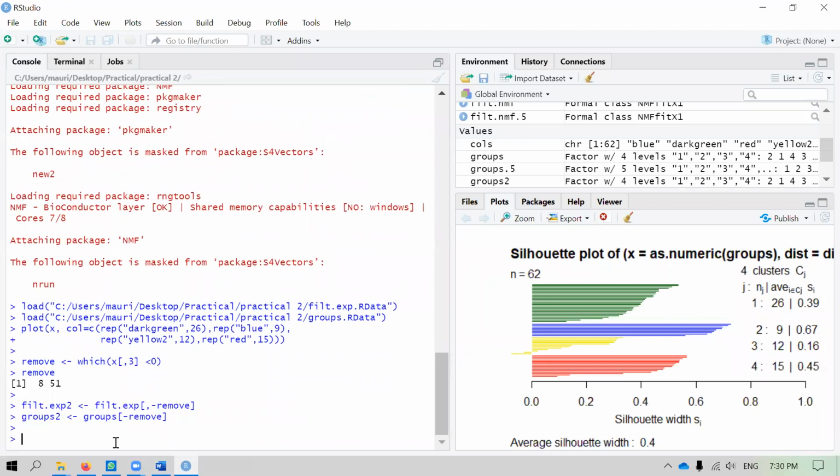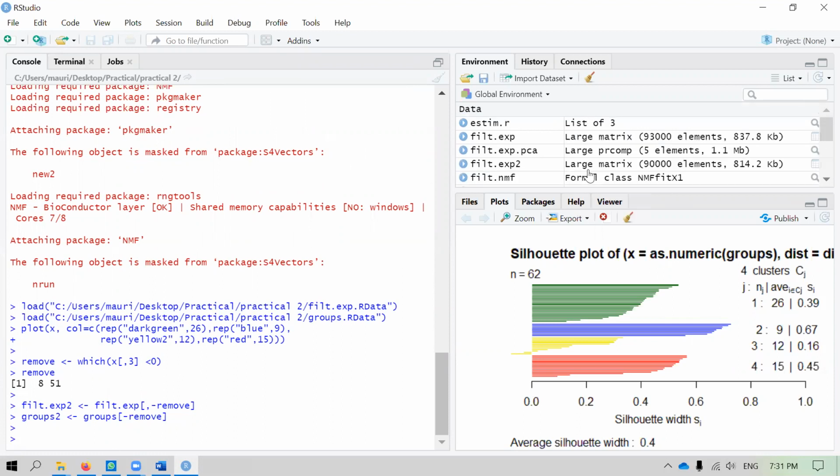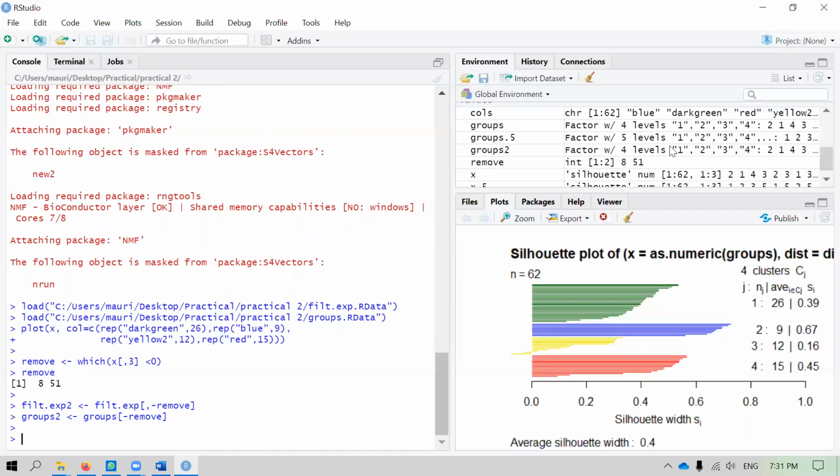Okay, so that's all, nothing very much. Okay, then if you look at here, your filter expression data, you remember that our original microarray data set, each sample has 1,500 probes. So we remove two samples, we actually remove 3,000 probes in all, or 3,000 data points. So we are left with 90,000 from 93,000. Okay. Yep. So that's what we have.